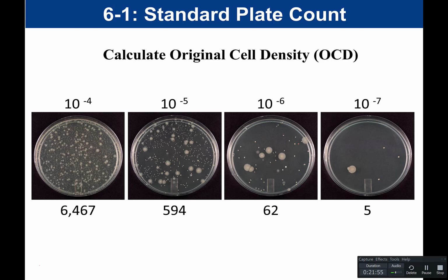That doesn't mean that you can exclude one or the other, because any colony that shows up on the plate is clearly a bacteria that was on the plate. So that's why we have to count all of our colonies. All of the colonies count, no matter what the size of the colony is, if they're large colonies or small colonies, etc. They all count.